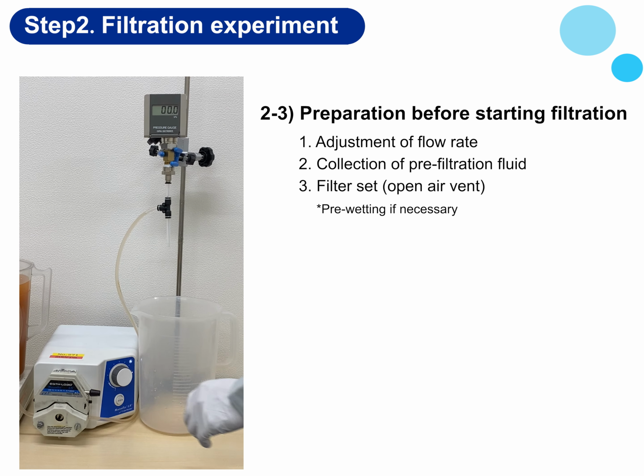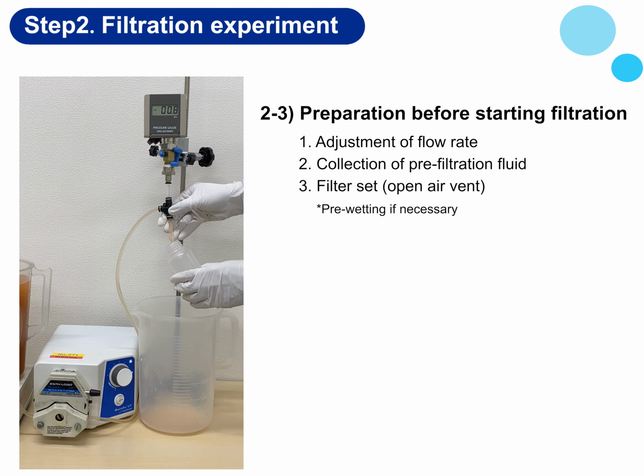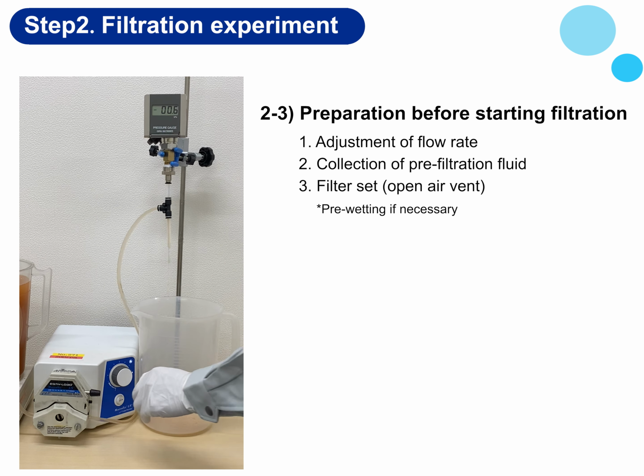To compare the quality of the liquid before and after filtration, the pump is operated once the line is assembled and a sample of the liquid before filtration is taken. Next, set the test filter. If the filter has an air vent, release it.